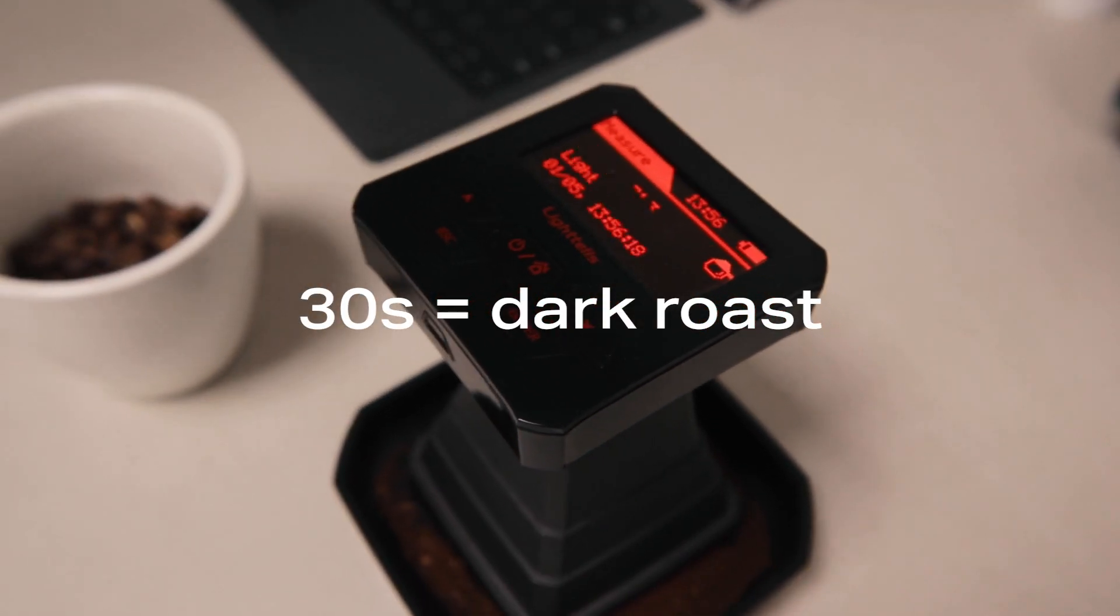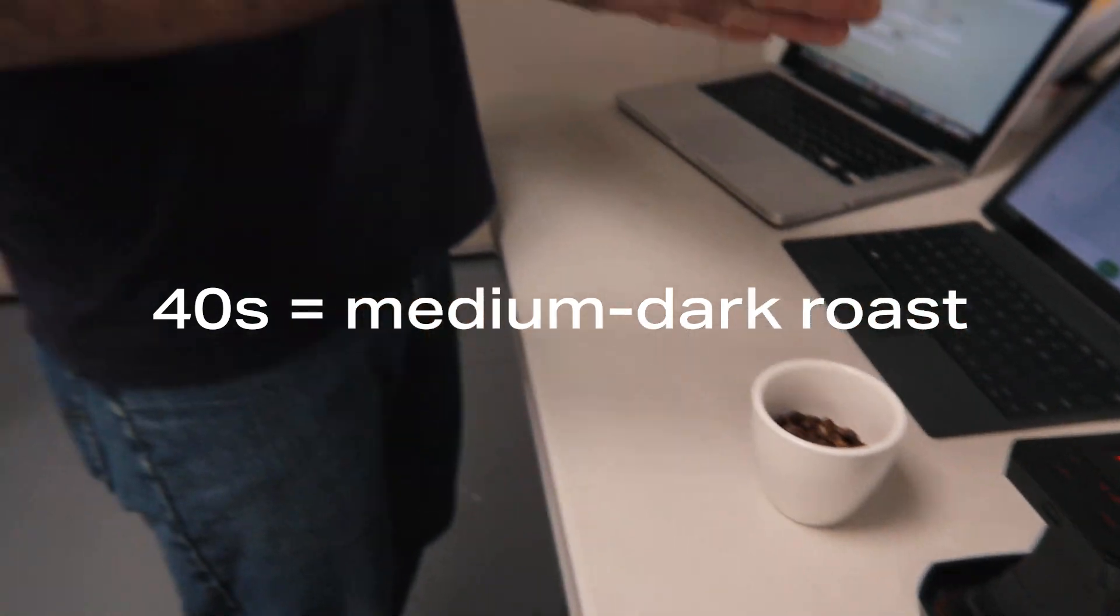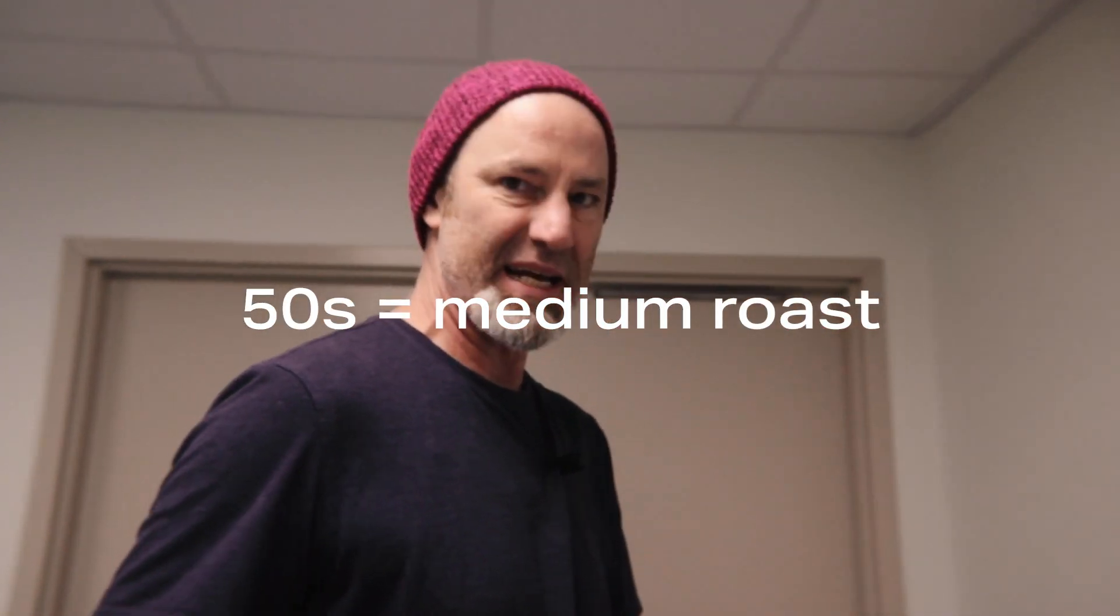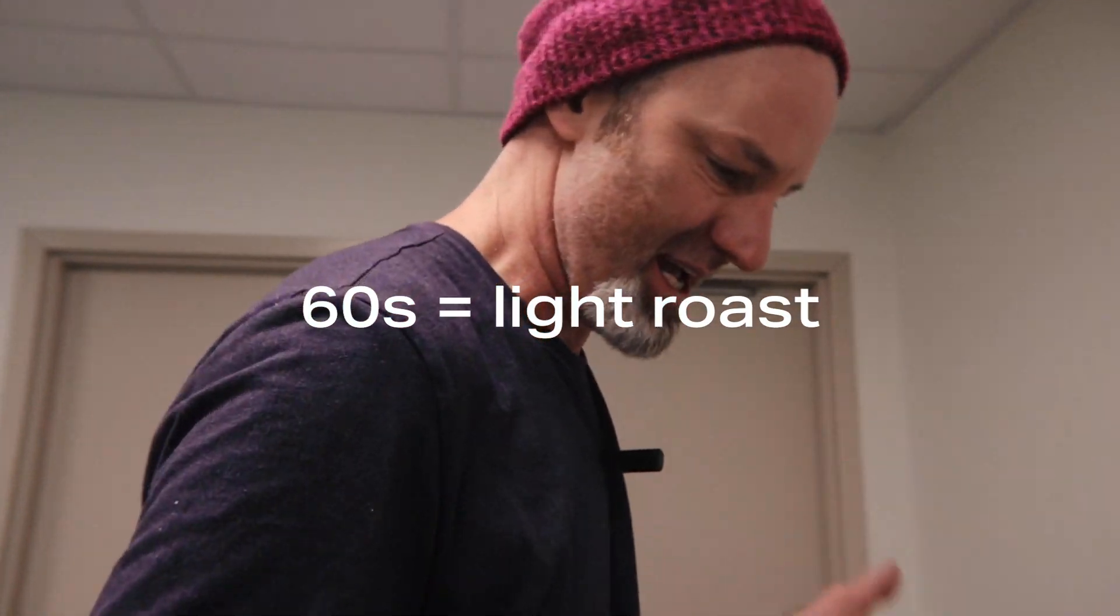30s are dark roast, 40s are medium dark, 50s are medium, 60s are light, and 70s.